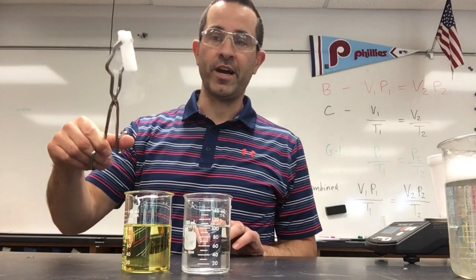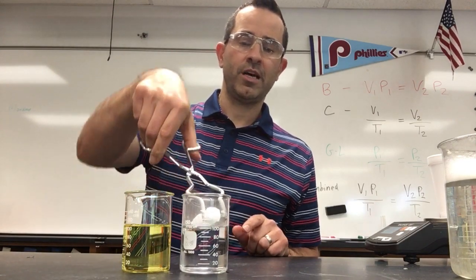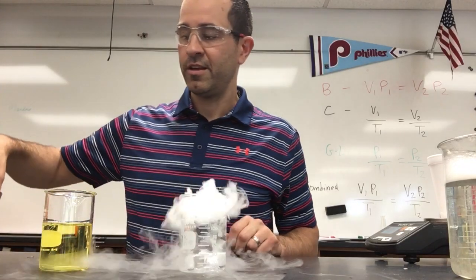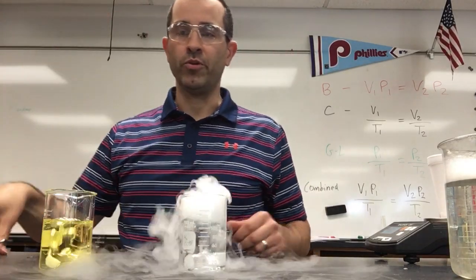And so we want to figure out what is the gas that we see here. So I'm going to take a piece and put it into my beaker of water. Check that out. Pretty cool. It's like a fog machine. And then let's take a piece of dry ice and put it in the vegetable oil.